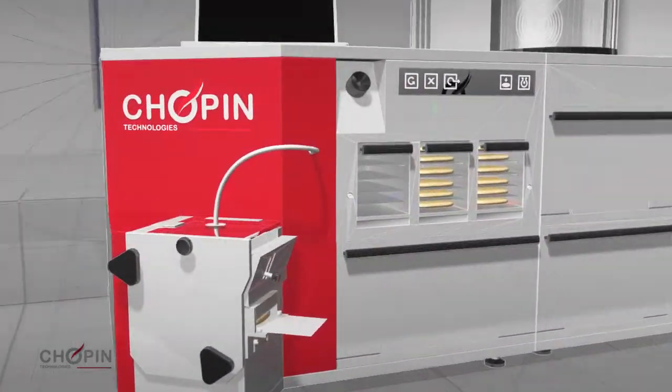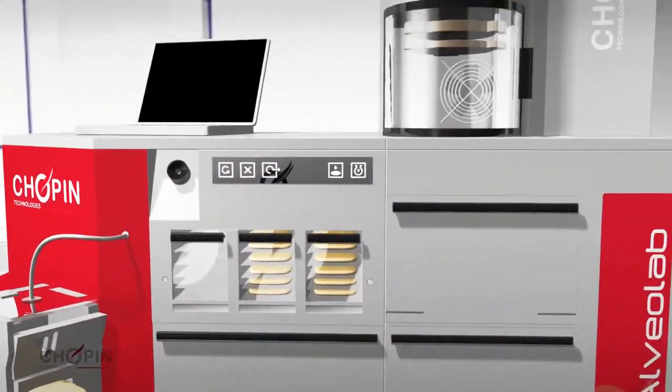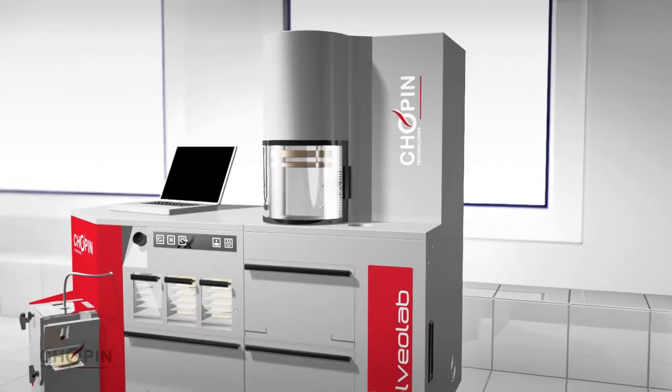The Chopin Alveolab represents the fruit of over 80 years of experience and today benefits from a number of highly significant innovations that make tests easier to carry out and more precise.